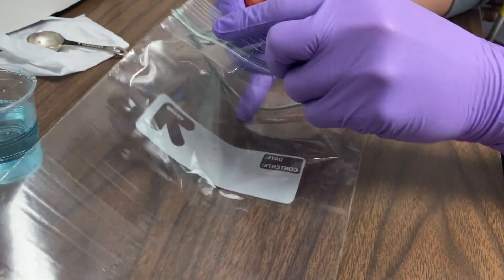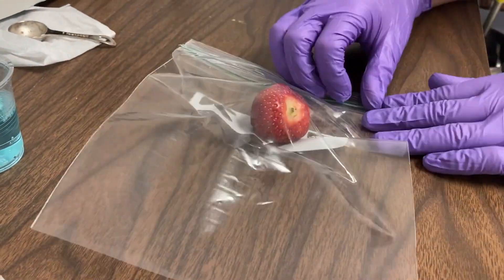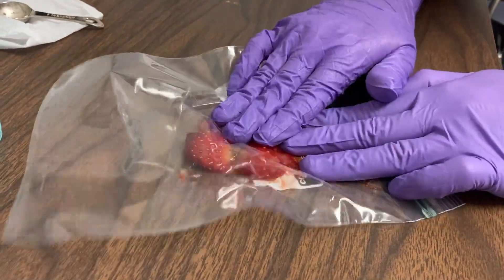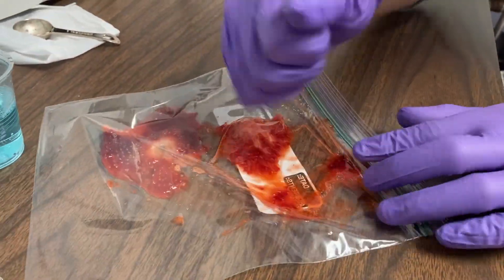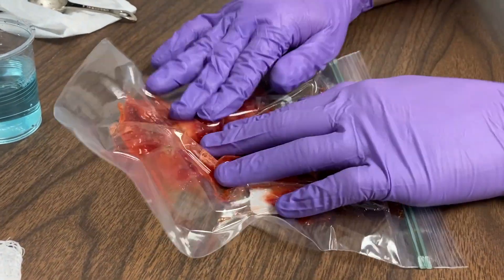Let's get started seeing if we can get some DNA out of this strawberry. We'll start by mushing it up pretty well in this plastic bag. You may remember that this strawberry is made up of cells, and that inside those cells may be DNA. So mashing this thing to get started makes sense.